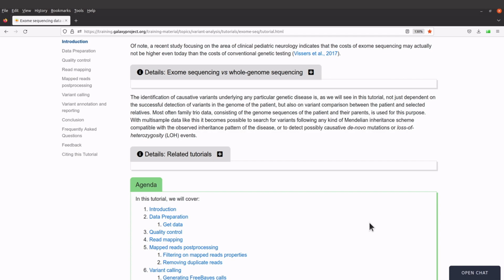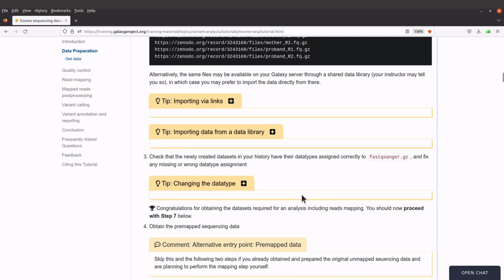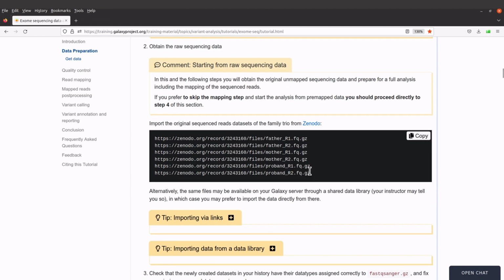So now let's proceed. Let's get back to the Galaxy page again and first download the files. I am here. First of all, I'm going to get the links to these files. Okay, we have 6 of them. That's for the FASTQ files, and we also have the one for the reference sequence. So we have a total of 7 files. Here again, I'm going to do some automation, which I'll show you. It's basically the same principle that we use for the mapping activity itself. So I'll first get the links, and then I'll show you what to do next.